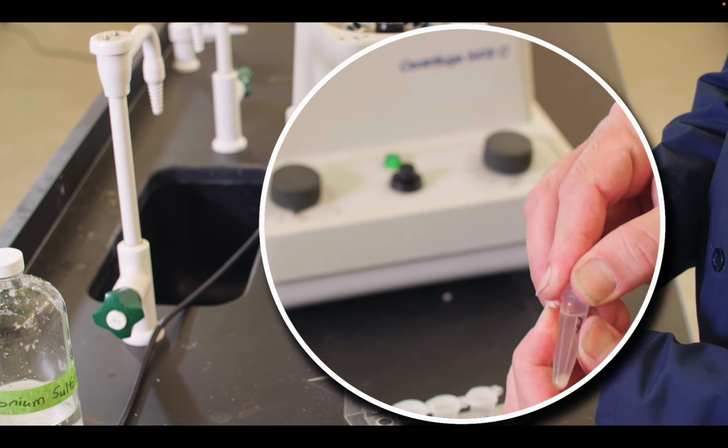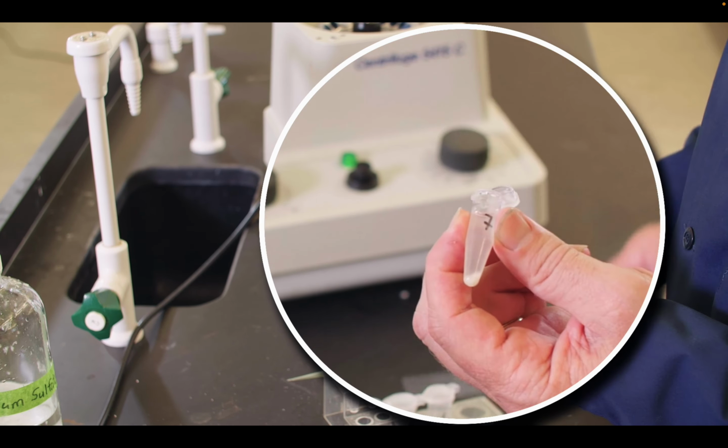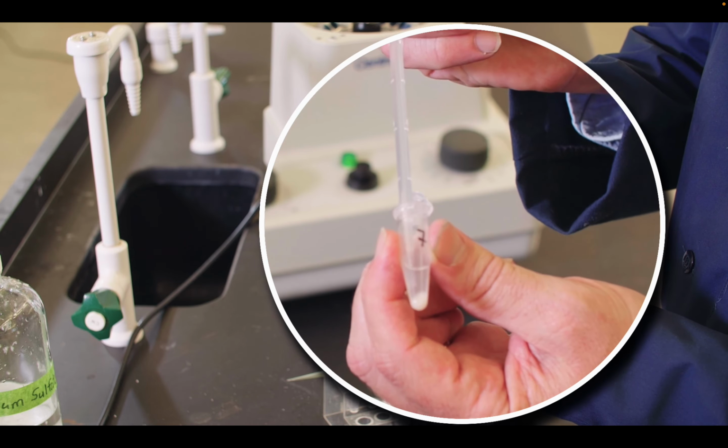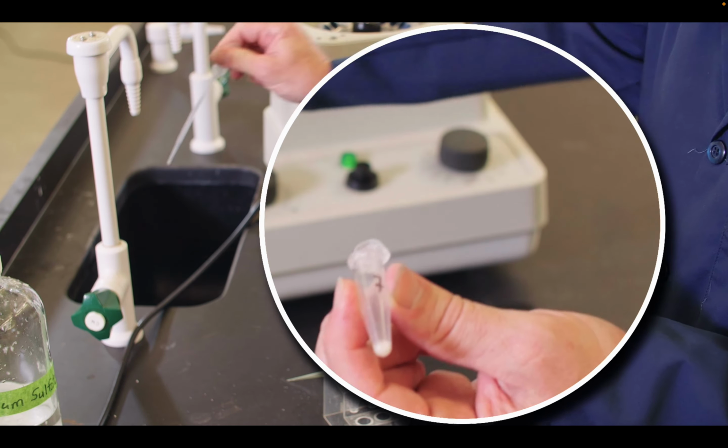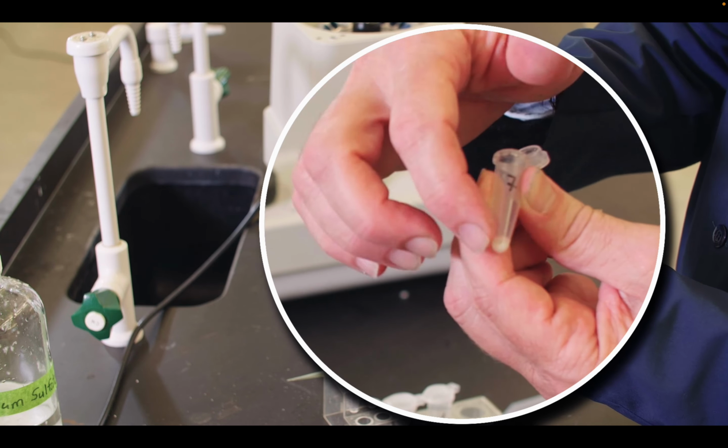So what we're going to do with these tubes is that we want to assay the amount of protein that's down here. In particular, we're going to assay or test for the amount of GOT. So in each case, what we're going to do is remove the liquid. We often refer to this liquid as supernatant, so we'll pull it off. We can just discard the supernatant, and we're going to have this solid. What we can do is just redissolve this in buffer, and then we can run our GOT assays on those.